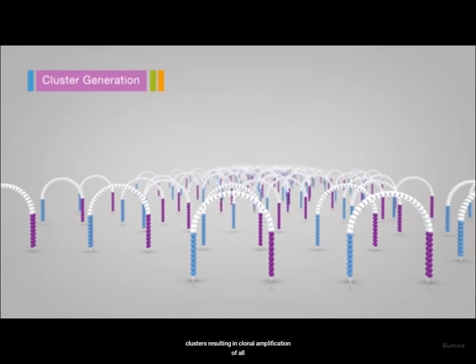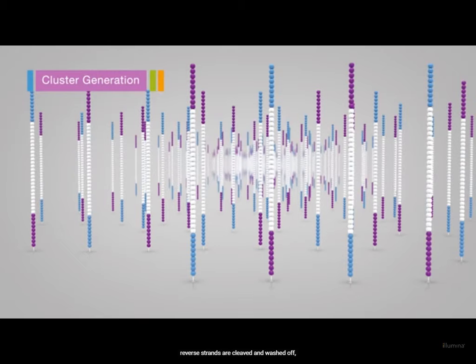How that's done changes from sequencer to sequencer. The reverse strands are cleaved and washed off.